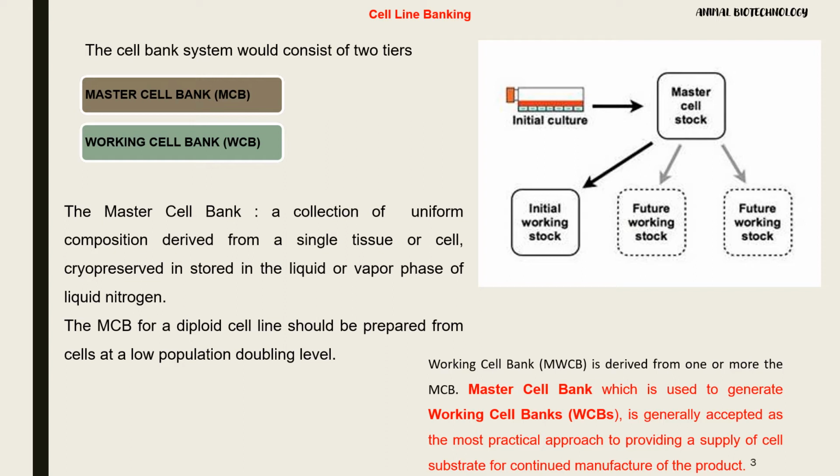The working cell bank is derived from the master cell bank. This is a generally accepted approach to provide a continuous supply of cell substrate for research work, medical use, and for manufacture of cell-based products in industry.